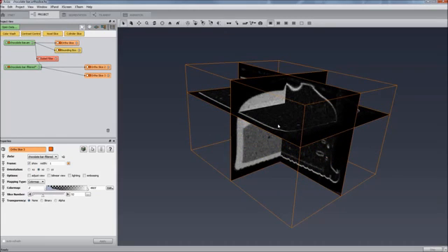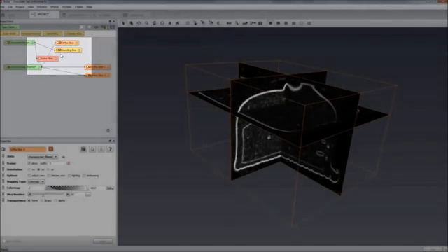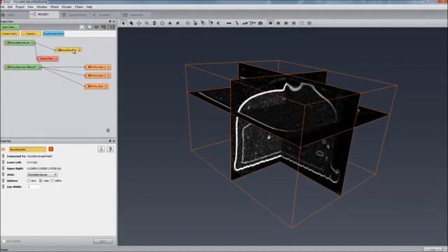To have a third view of my filtered dataset, I could create another new slice or reuse a previously created one. For example, I could use the slice connected to my original dataset. For this, I simply click on the link and drag it onto my filtered dataset. For a better comprehension of my workflow, I can move and arrange the modules inside the project view.